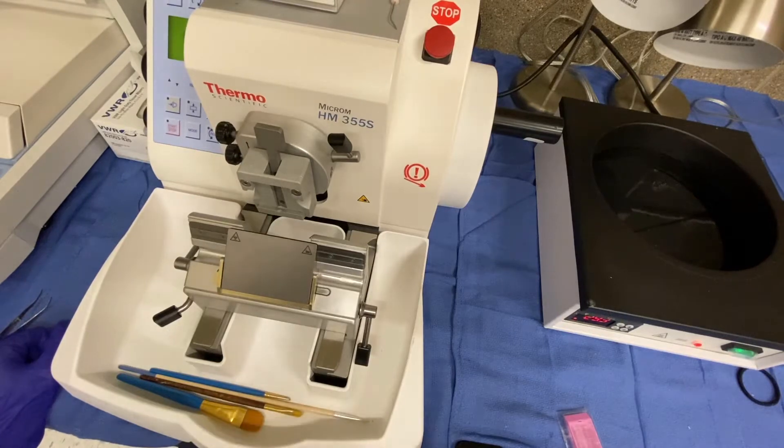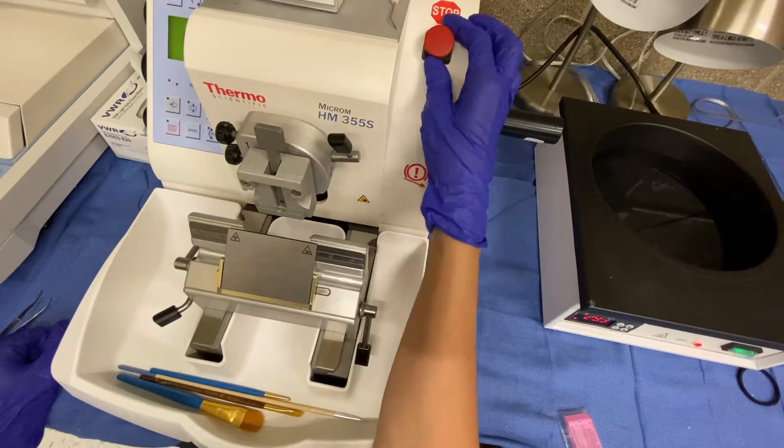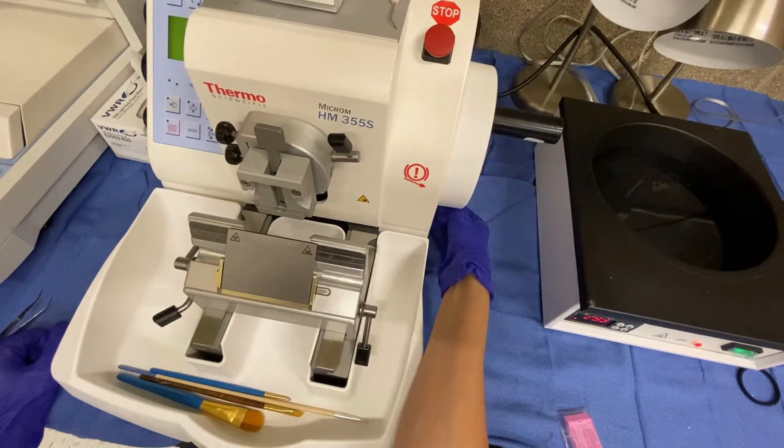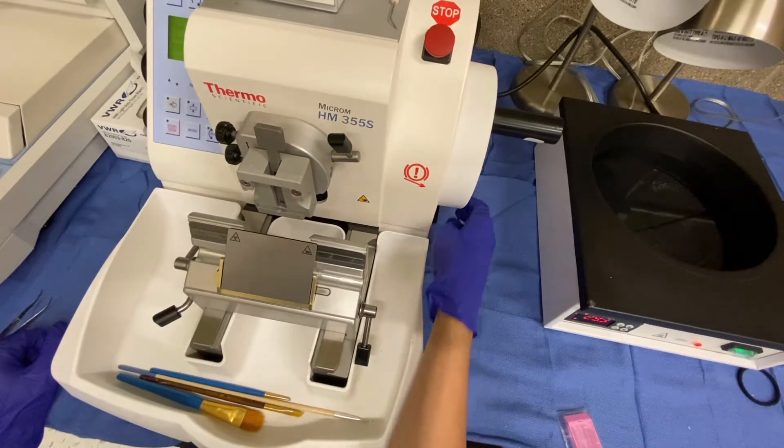The first thing you need to do is unlock the stop button here. You basically lift it up and pull it towards yourself. Additionally, there is a lever at the bottom that needs to be pushed down. This also unlocks the machine.